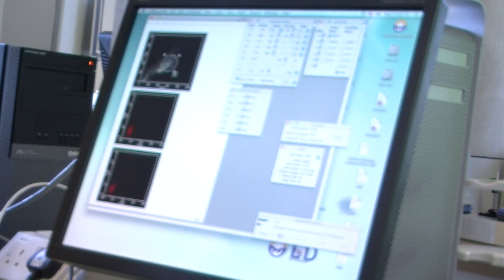This looks to be fairly rapid. 1,000 there. Good. And so this is the last of our isotype match controls. So we've run them in duplicate.